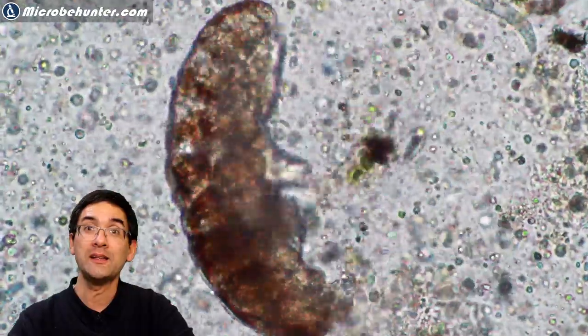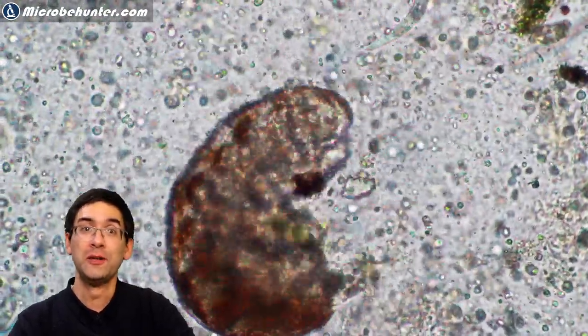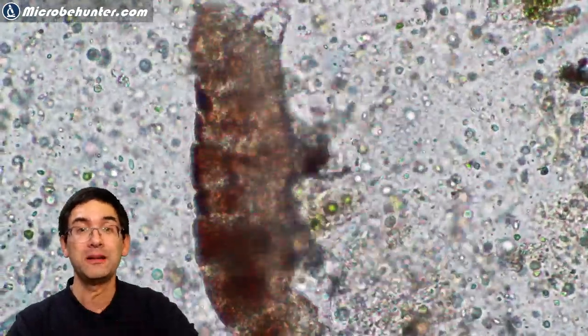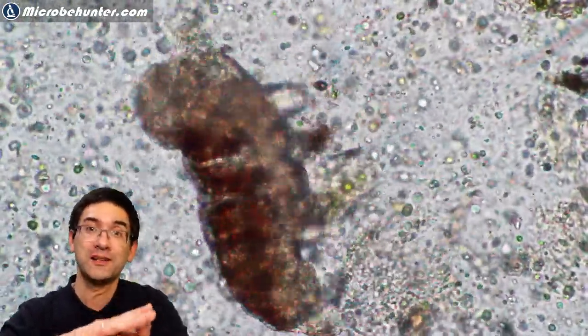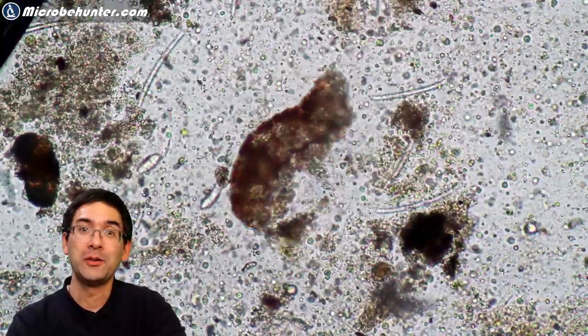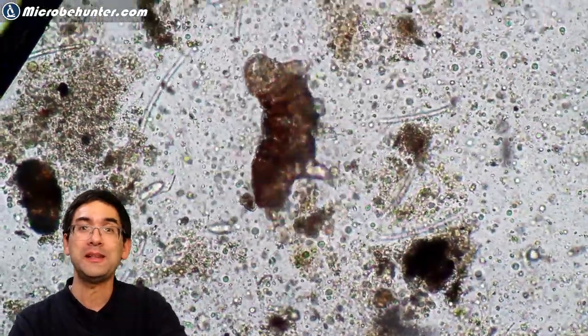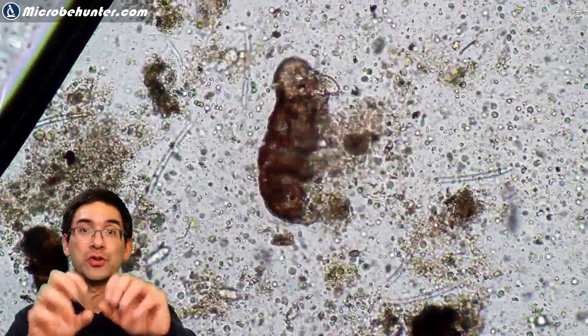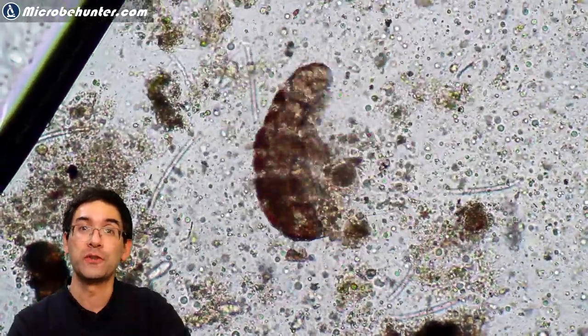What we can see here now is that the tardigrade is lying on its side and trying to move ahead, but having some problems. It needs to flip onto its belly so that it actually contacts the glass slide — it hasn't done that yet, but later on I'll show you it actually does. If you zoom in a little bit you can also see that they have claws, which they use to move forward and cling to certain surfaces.